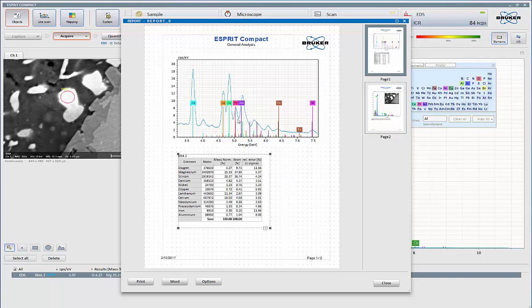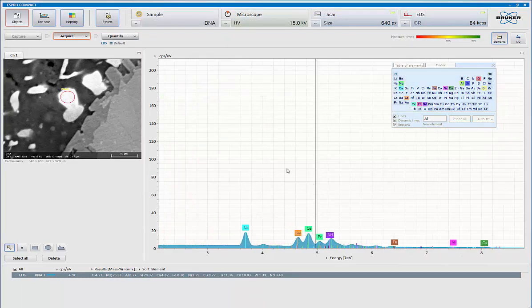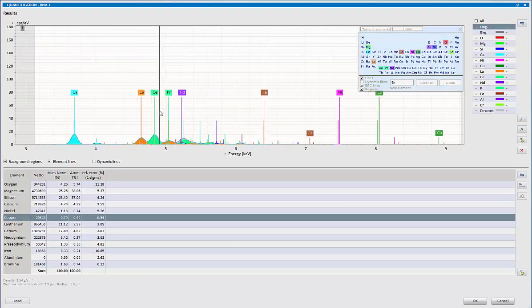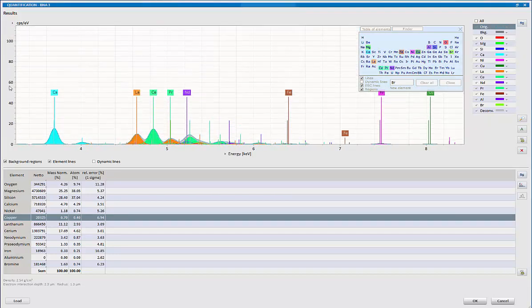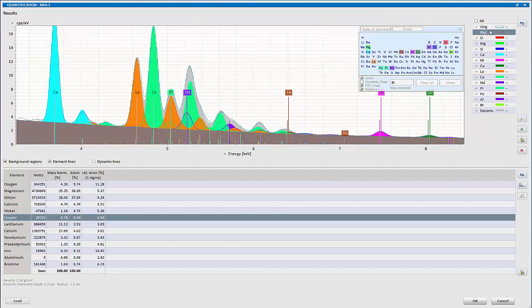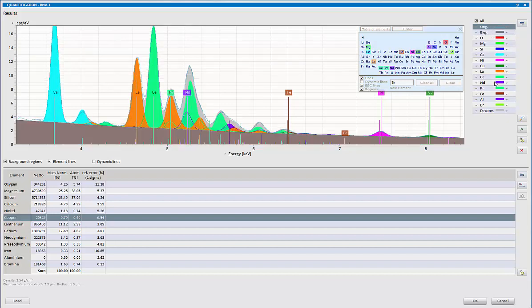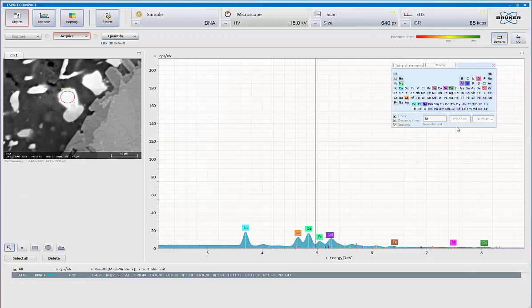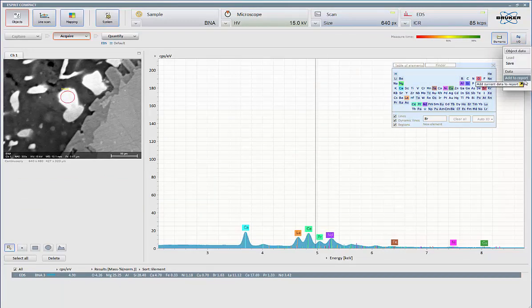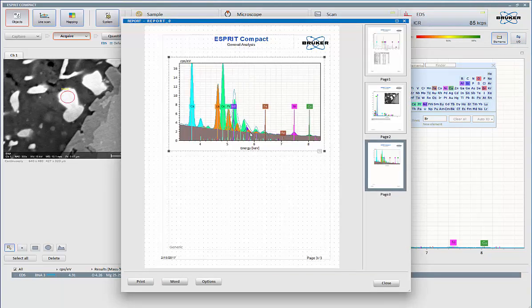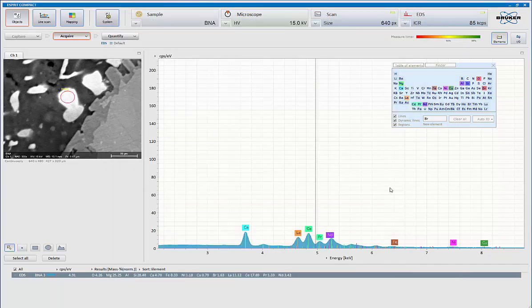If you want the individual deconvolution, we can do that as well, simply by going back into Quantify. And now highlighting exactly what we want the system to show. So with that, we hit OK, we now say, add to report. And when we look at the report now, there's our results, showing all the individual components. So we can look at the overall with that. And now, as I add more to the information, it will keep appending to the page in the report.